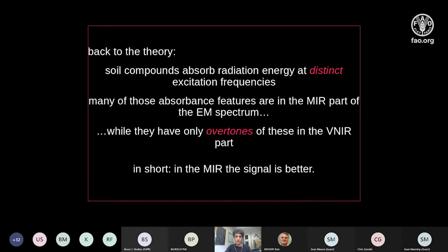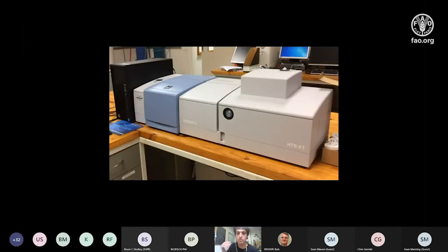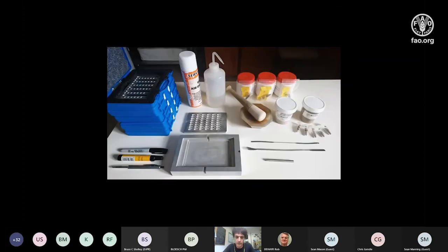Then we more recently got involved in mid infrared spectroscopy. We thought it sounded very good. I'm going to spare you the theory, but we invested in that Bruker instrument, which I think arrived here in 2017. Ever since, we've got used to the procedures, and it took quite a while compared to NIR. In our experience it's a bit of a step up in terms of SOPs.